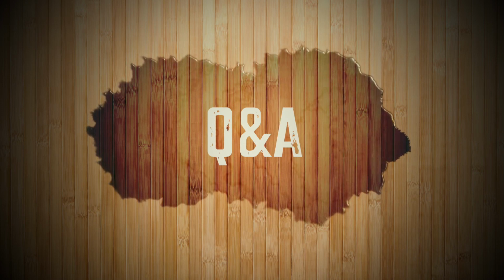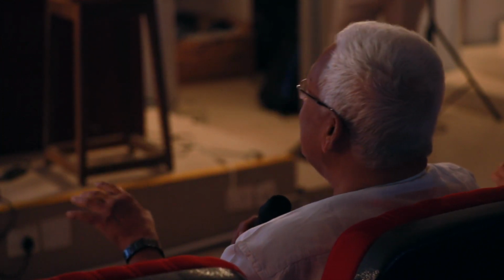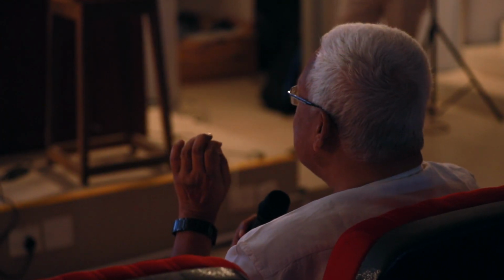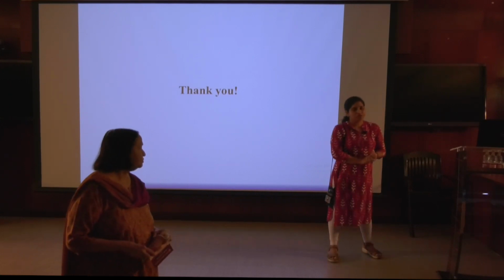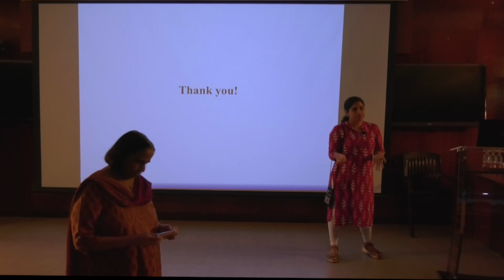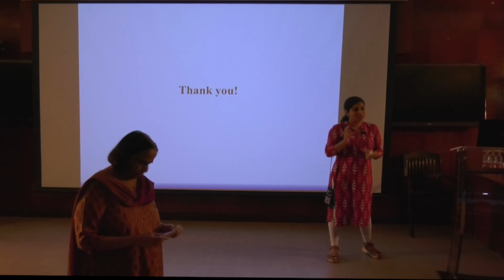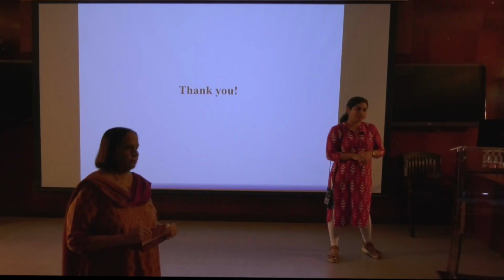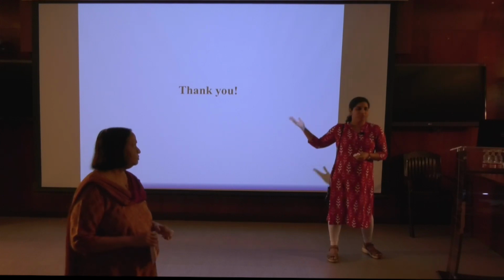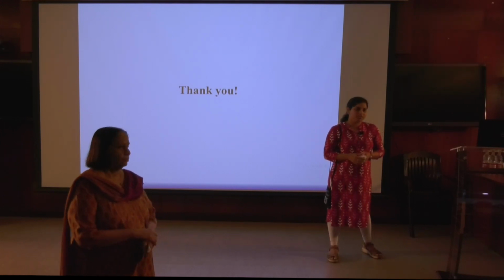You showed that some particles are homogeneous, some are inhomogeneous. I understand the homogeneous, but there is very important biology in inhomogeneity. So when you make an average for the presenting image, are you not missing some very important information? I think that's definitely a valid point. A lot of the original structures assumed everything is homogeneous, but more and more we are considering that even things that look homogeneous can have small heterogeneity or differences, and in those cases people have been using cryotomography and other methods to avoid missing that.